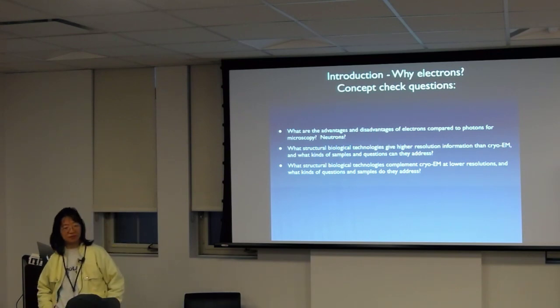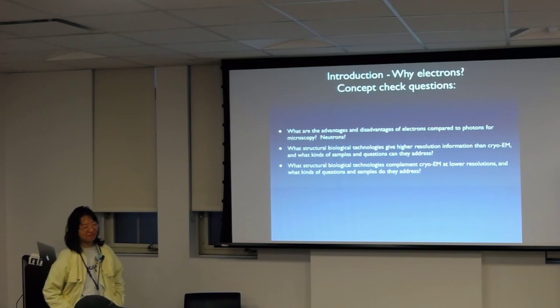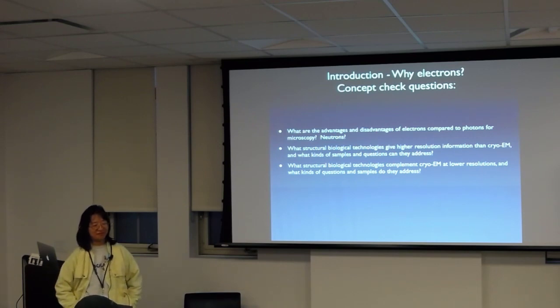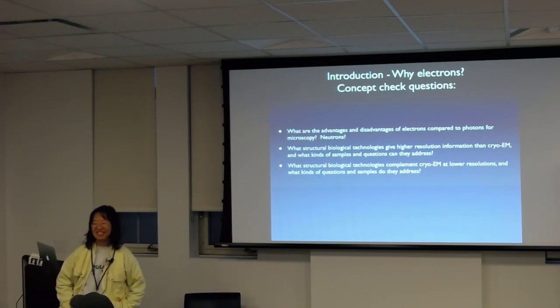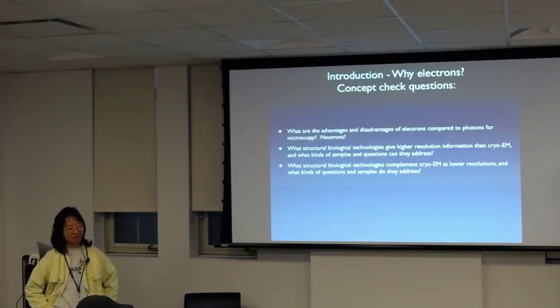They also have small wavelengths, which is good for imaging, but are much less destructive than electrons. So if we can figure out how to make a neutron microscope with a nice source of neutrons that is coherent, doesn't take up a ton of space, isn't massively expensive, and we can figure out how to focus them, it could be great, if you can deal with all of those problems. So you're saying there's a chance. Somebody probably thought the same thing about electrons at one point. How the heck do you make a stable source of electrons? Light's easy, relatively speaking.